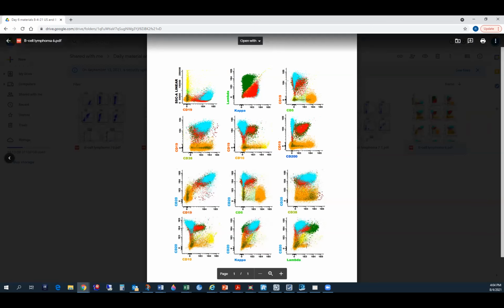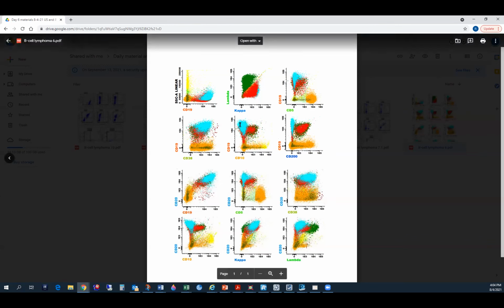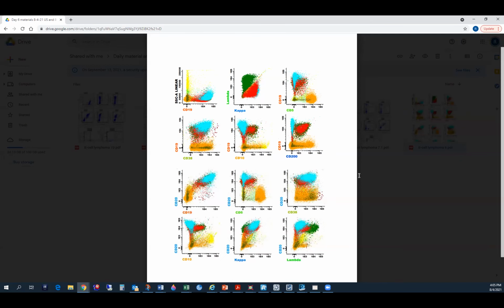And also, when you described 19, you said it's moderate. I think it is decent, bright, actually, because you see your background polyclonal B cells here. This one has a little bit brighter 19 than that, and actually that is nicely demonstrated in the 19 versus 10 plot here. Okay, good. Thank you. At least a subset looks brighter. Sure, sure. Thank you. Yeah, it's helpful. Thank you.